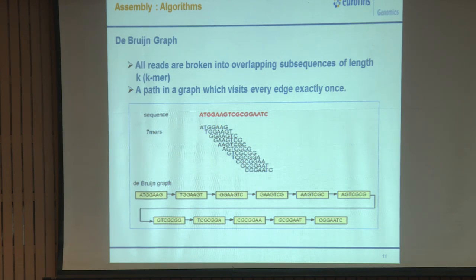So, if I say 27, my 150 bases, as in 2 into 150, that 150 bases is chopped into 27-mers, right. Just imagine millions of reads, 10 million reads getting chopped into 27. So many read fractions get created. These are the small fractions of reads which are getting created. Now, in this, one sequence will be finding its overlap against the other sequence.